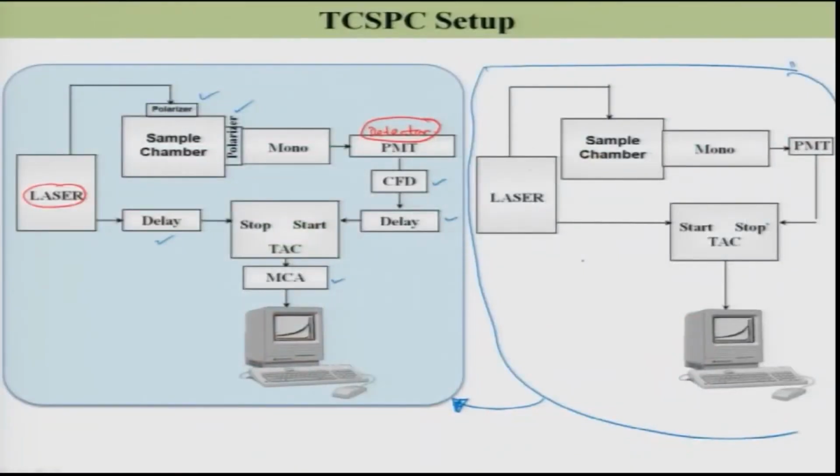When the laser has excited your sample, it sends one signal to start counting the time, and then there is emission of a photon from the sample, and the first emitted photon is detected by this detector. This detector sends the signal, okay, now I got a photon, so you stop counting. That is the time between the excitation and the emission of a photon. And we plot such events millions and millions of times to get the histogram, you remember.